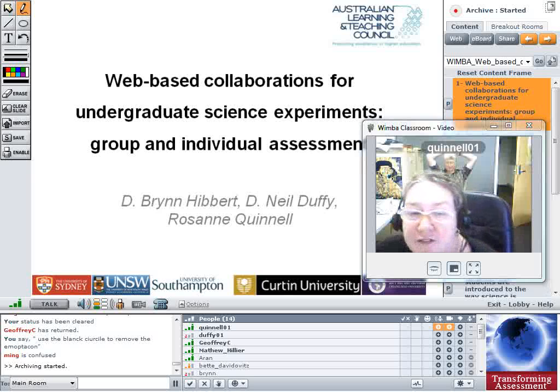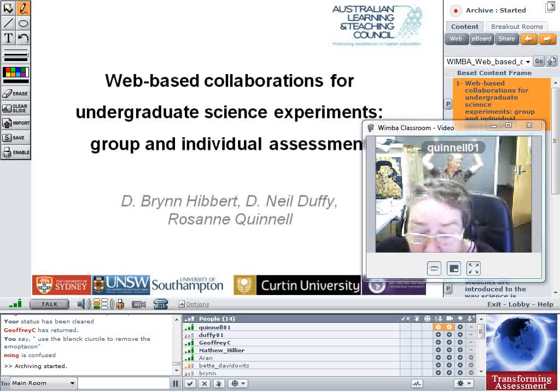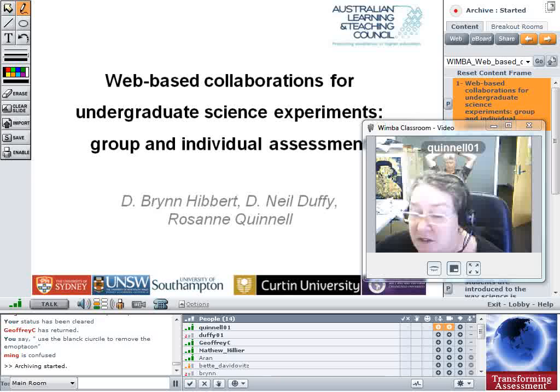So first of all, I'll just give you the title. It's Web-Based Collaborations for Undergraduate Science Experiments and Group and Individual Assessments. It's a collaboration that's been funded by the Australian Learning and Teaching Council, and it's a collaboration across national borders. It's a collaboration across our state borders in Australia. So it's across University of Sydney, University of New South Wales, Curtin University in Western Australia, Southampton University in the UK, and Chiang Mai University in Thailand. And it's the implementation of an electronic laboratory notebook for undergraduate chemistry in the first instance.